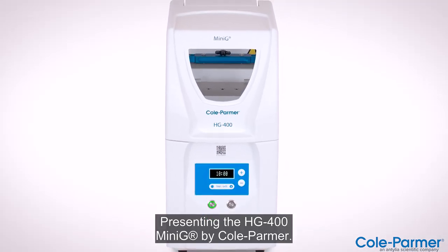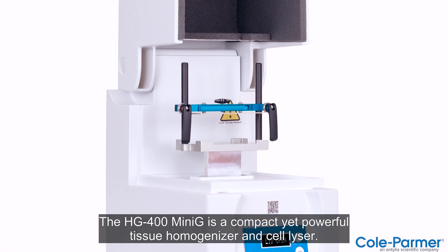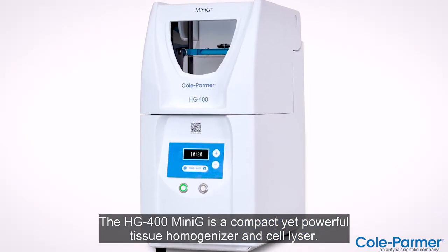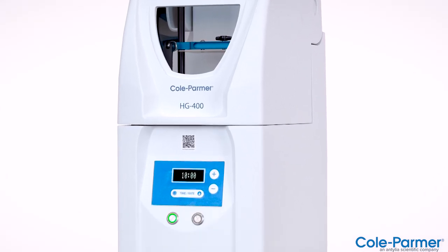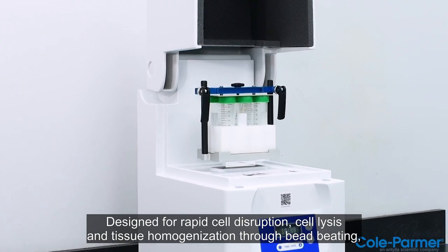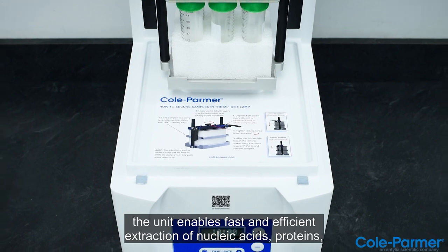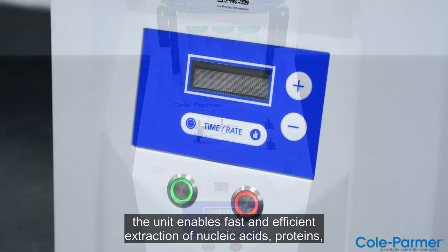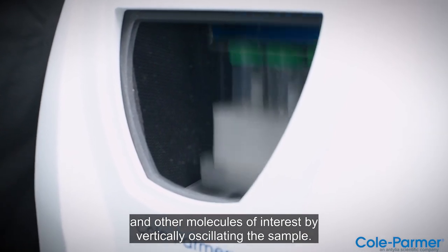Presenting the HG400 MINI-G by Cole Palmer. The HG400 MINI-G is a compact yet powerful tissue homogenizer and cell lyser. Designed for rapid cell disruption, cell lysis, and tissue homogenization through bead beating, the unit enables fast and efficient extraction of nucleic acids, proteins, and other molecules of interest by vertically oscillating the sample.